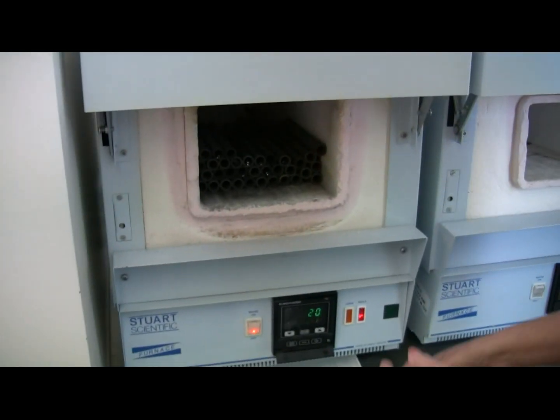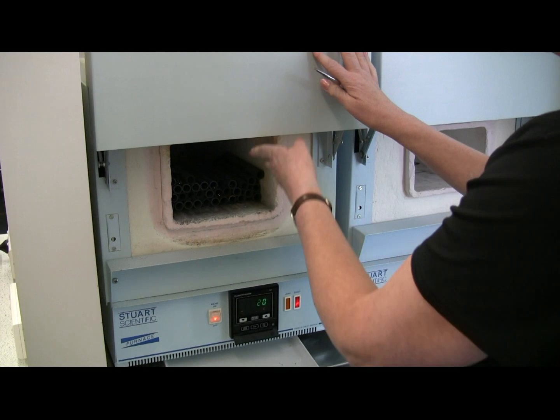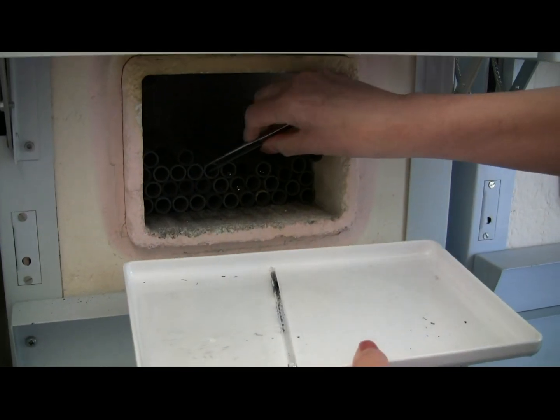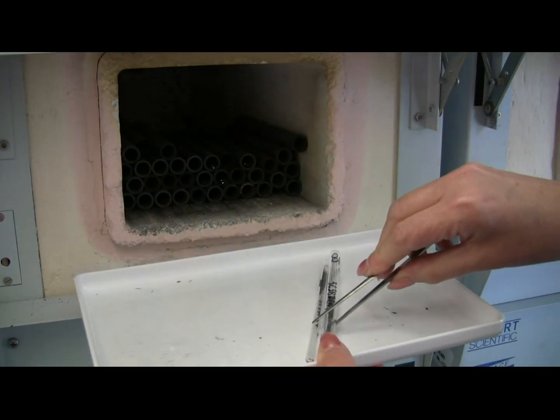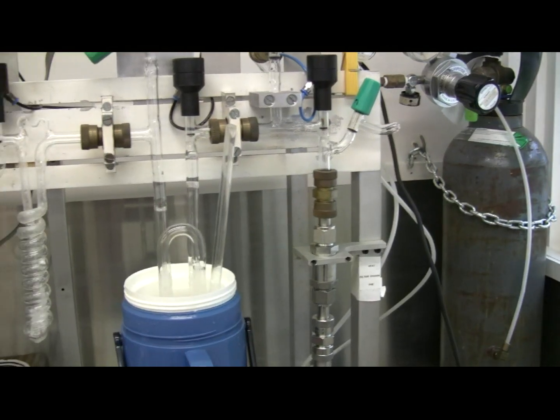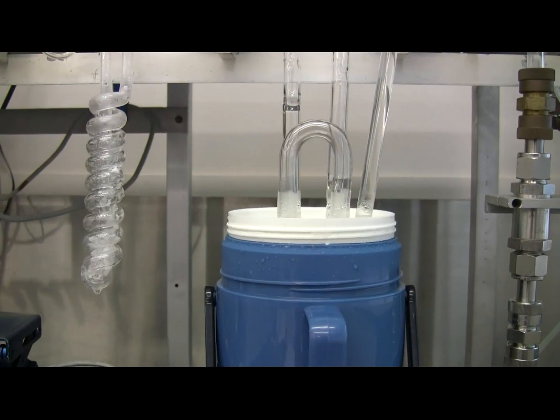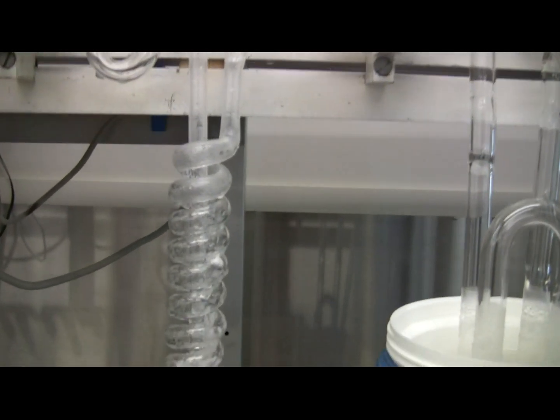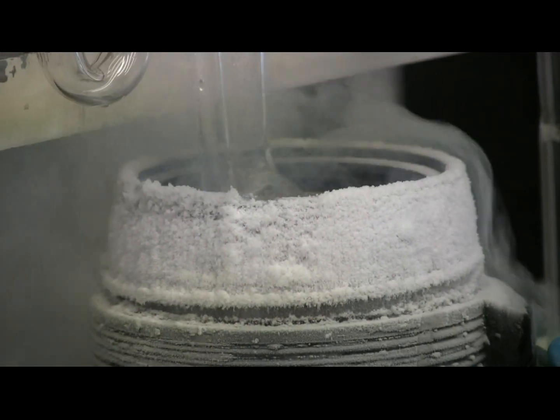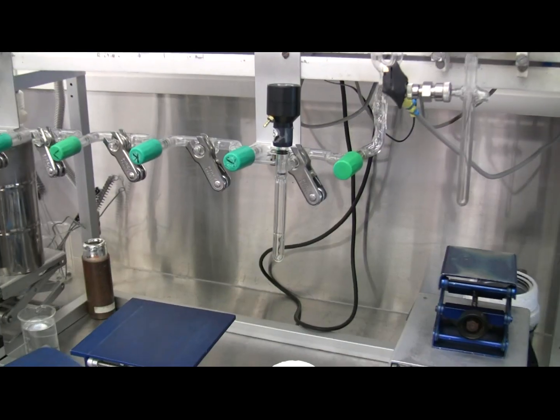900 degrees. The copper oxide will cause the solid sample to combust, to burn, and will end up at the end of the process, after it's been combusting overnight, with carbon dioxide and a little bit of water inside the combustion tube. The combustion tube is cracked, and the CO2 is transferred through these traps into a small bottle. The first trap is a water trap, and the second trap is where we collect the CO2. The volume of the CO2 is then measured very exactly so that we know how much we got, and then it's transferred into this small bottle here.